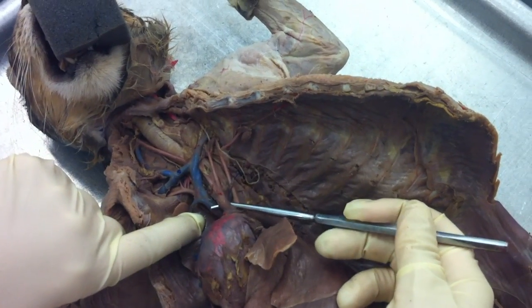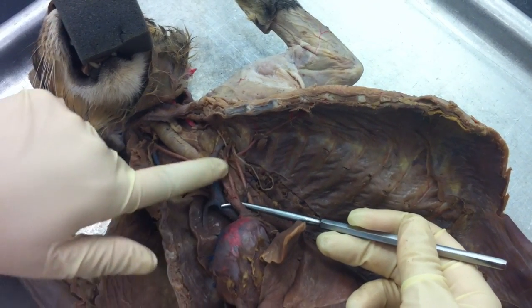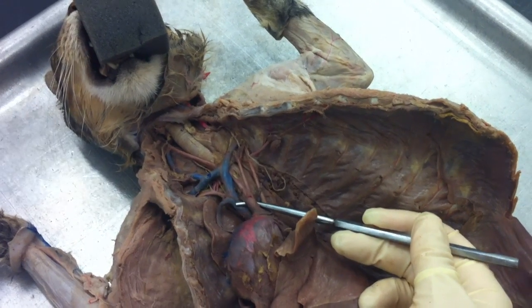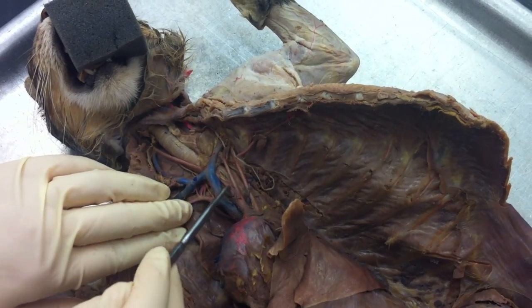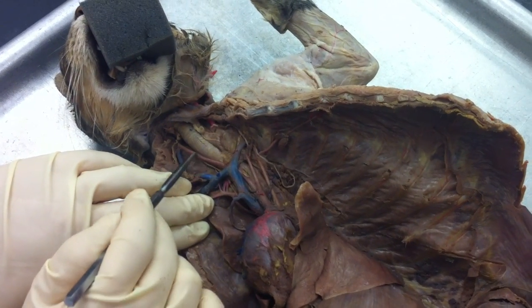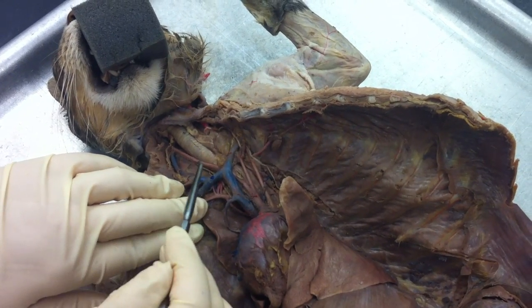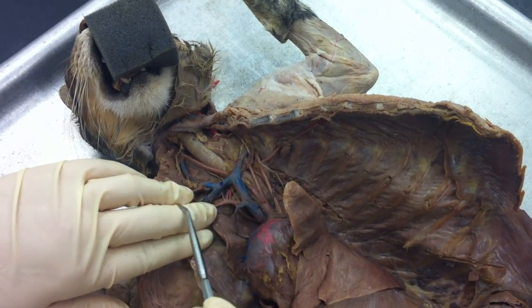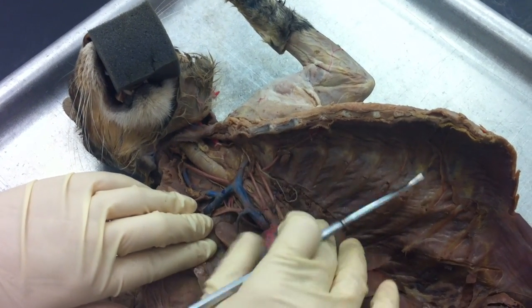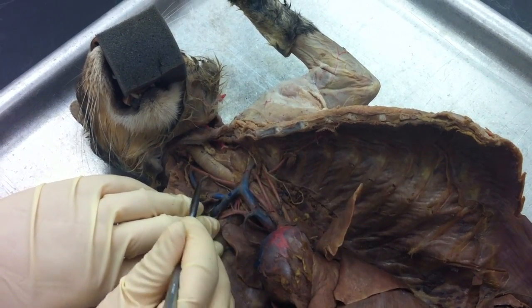This one right here is the brachiocephalic artery, because you're going to get these branches that either go to the head or the arm. Brachio for arm, cephalic for head. These two are the ones that are going to go to the head, this one up here and this one up here. These are the right and left common carotid arteries. You have to put artery or vein in all of your answers, and you have to put right or left if it's appropriate. So there's left, there's right common carotid.